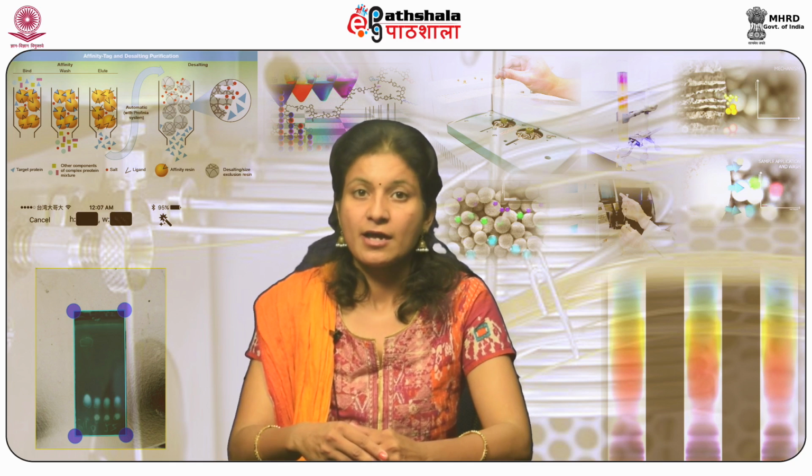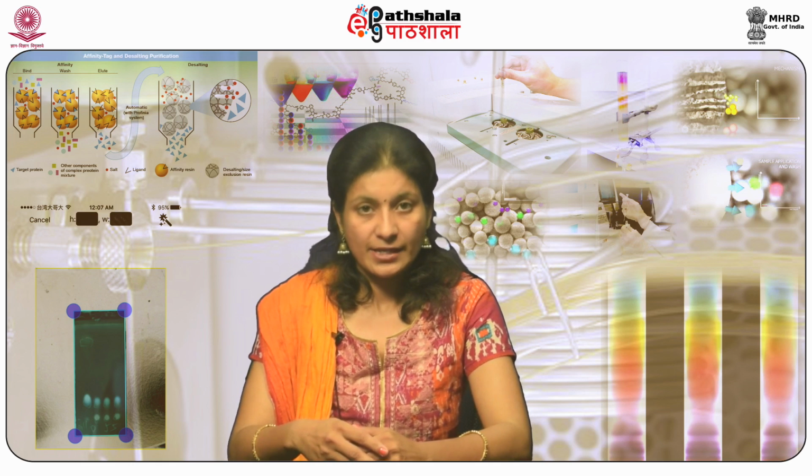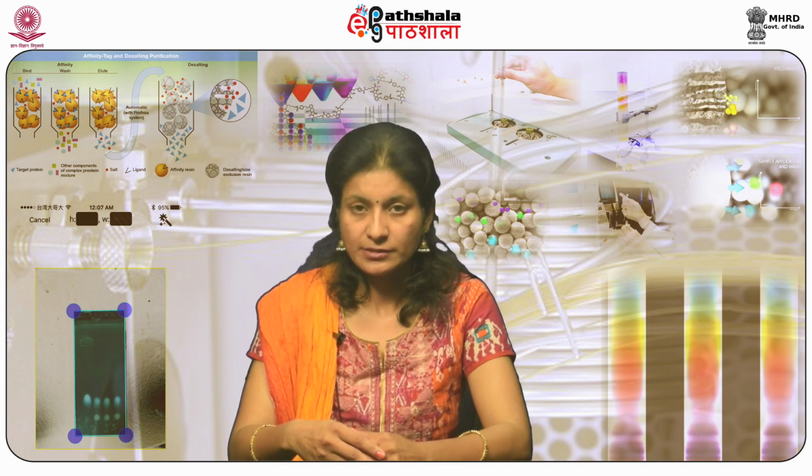That is, with the help of rancidity, analysis of residual pesticides, herbicides, etc., analysis of fragrances and flavors, fatty acid profiling of fats and oils, fatty acid methyl esters, FAME analysis.